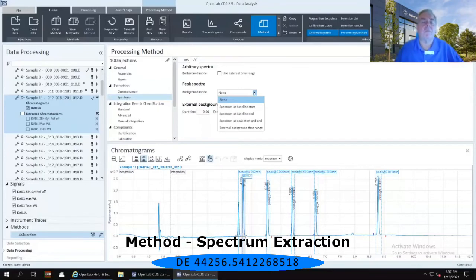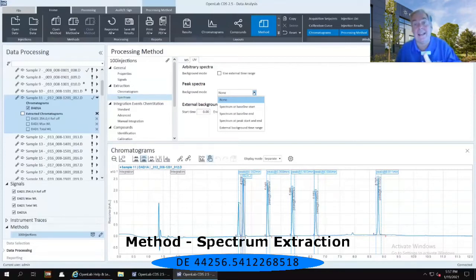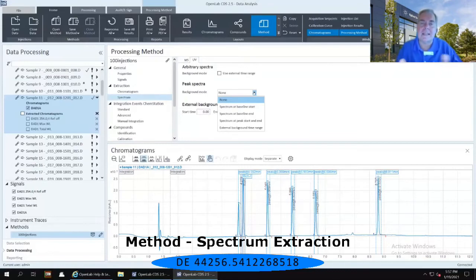If I decide spectrum at the end of the peak, most of my customers typically do the spectrum at the peak start and end. That seems to be the most consistent in the industry, at least in the pharma industry.